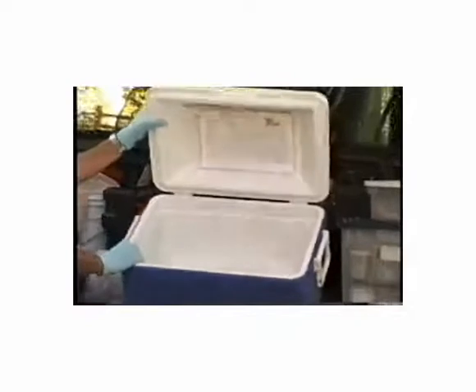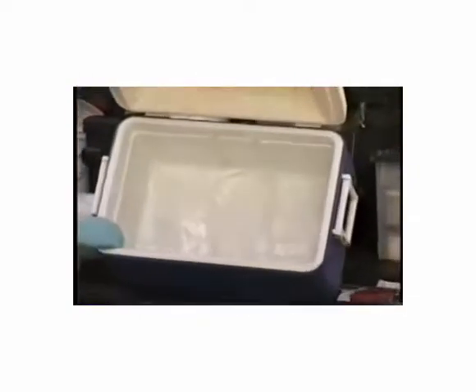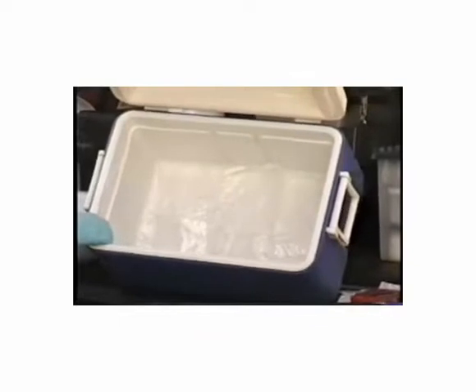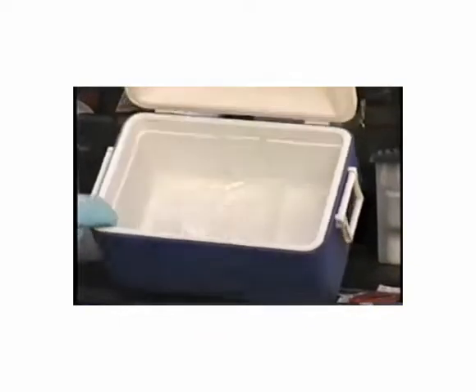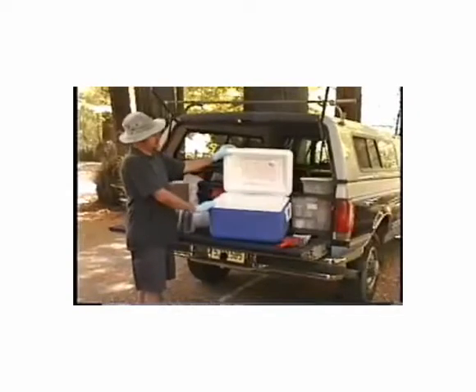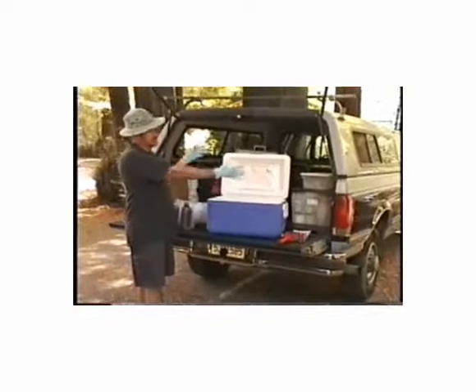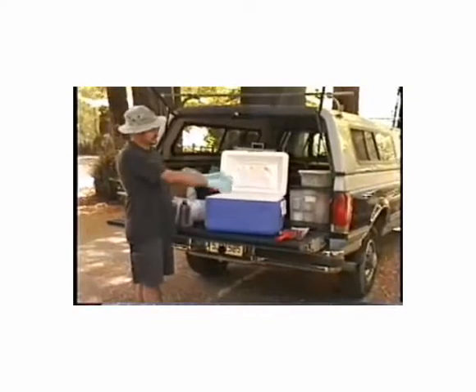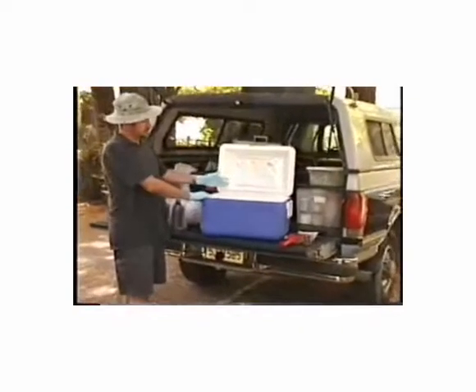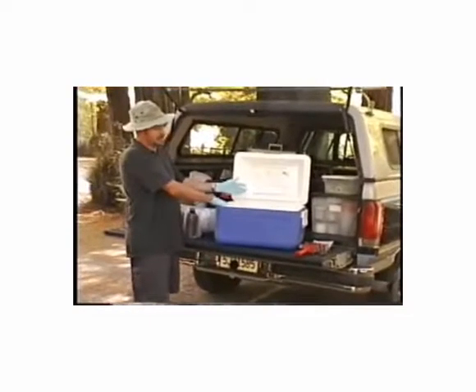We also want to line the bottom of the cooler with bubble wrap to prevent bottle breakage in the cooler if the cooler was dropped or somehow mishandled during shipping. Next, we would want to put a large plastic trash bag into the cooler to seal all of the ice and all the water samples in the cooler, to make sure that if something does happen to the ice or the bottles, that water will not leak out of the cooler.